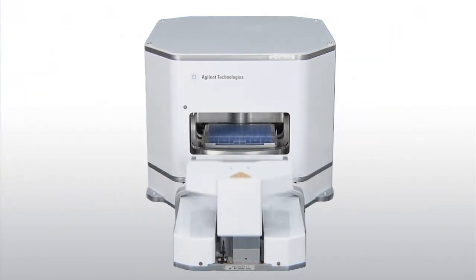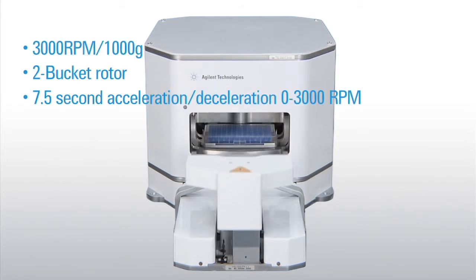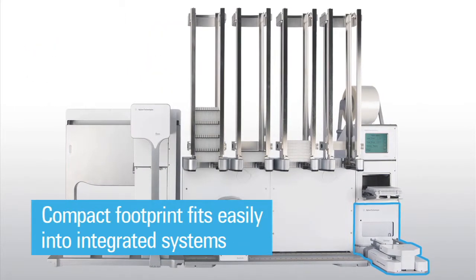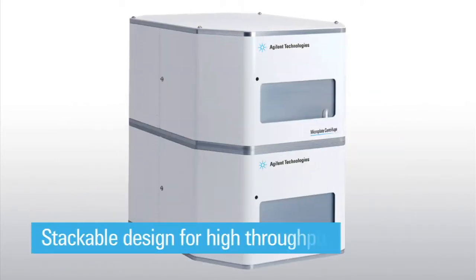The Microplate Centrifuge is capable of rapid, customizable acceleration and deceleration, minimizing the required cycle time. Its compact footprint takes up very little bench space and fits easily into integrated systems, while its stackable design allows for multiple units to be stacked on each other for increased throughput with no additional bench space needed.